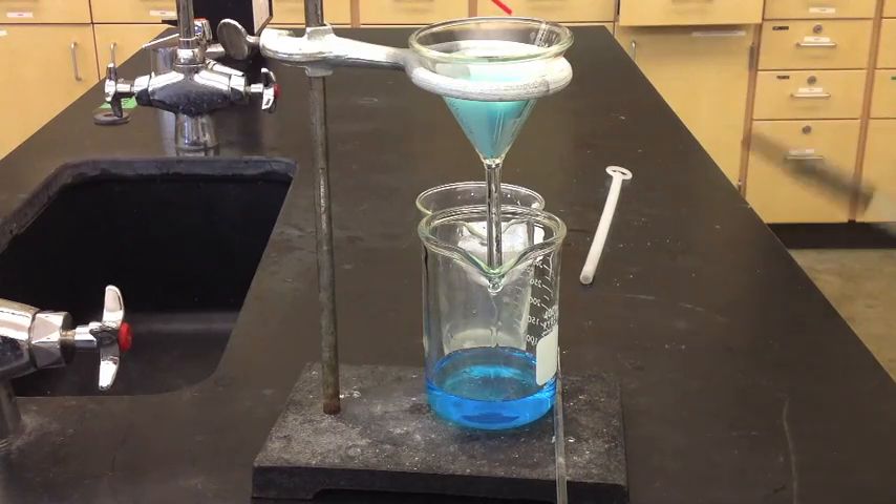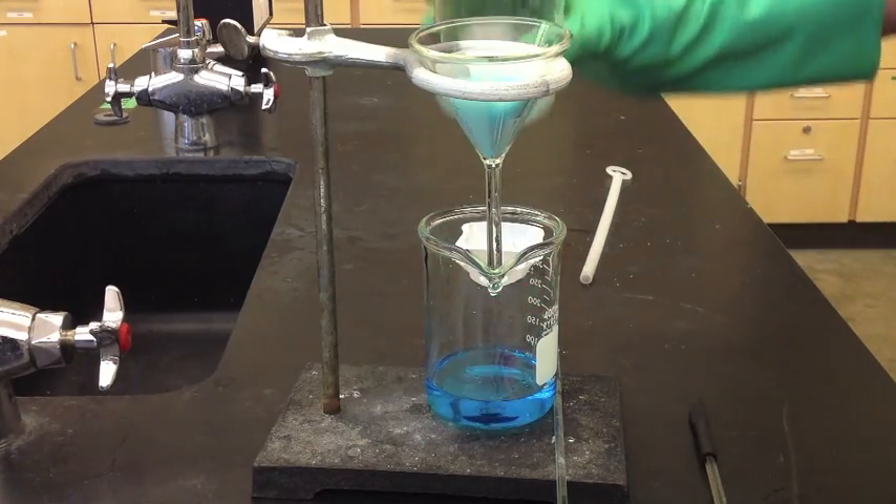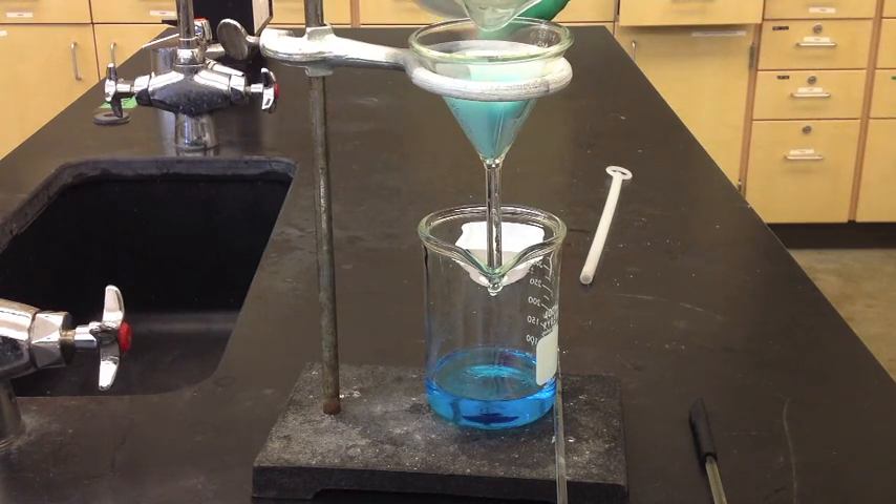The procedure says to take the filtrate from the bottom and run it back through. If you need to, you can do that — in this case it came out pretty clear, so I wouldn't bother doing it a second time.